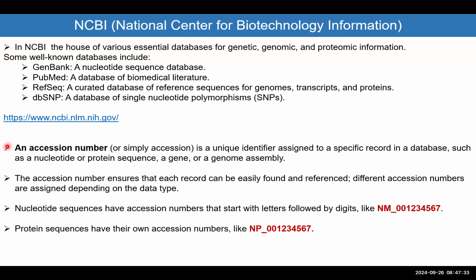Now, something you have to take into consideration is that in the NCBI, there are accession numbers for each of those genes. In other words, there's a unique identifier for each of those genes or sequences that doesn't overlap with any other gene. So if you write an accession number in NCBI, it will bring up only one product. Now, the accession number could be in different versions because different information has been introduced, but the original number stays exactly the same.